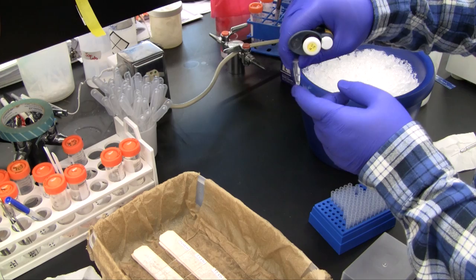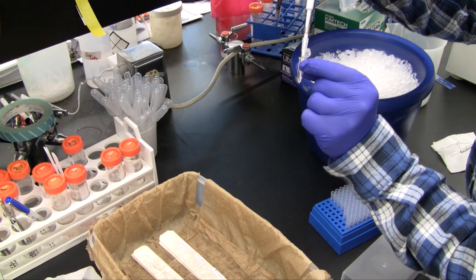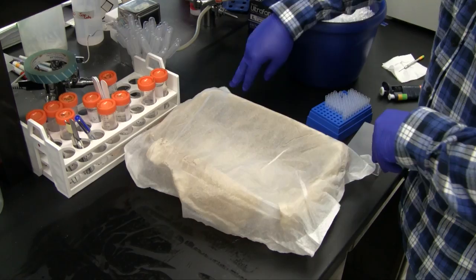To drop the cells, they are first resuspended in the solution by gently tapping the tube or stirring with a pipette tip. 5 to 8 microliters of cells are taken from the top third of the liquid column and dropped directly onto the slide. Cells can also be dropped from a few millimeters to facilitate spreading. The humid chamber is then covered with a moist chem wipe until the slides are dry. The slides are cross-linked to prevent chromosome detachment.